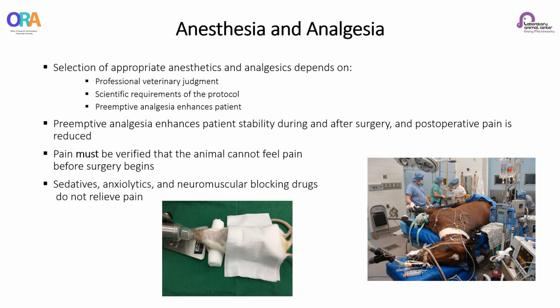Chronic pain may be more difficult to control. However, commercial options are available for slow release of analgesics. Animals should be closely monitored for signs of pain because there is considerable individual variability in the response to analgesics in each animal. Nursing support and non-pharmacological control of pain may also be effective.